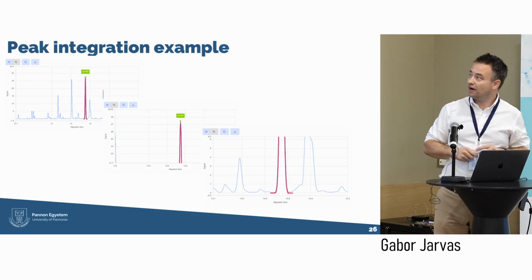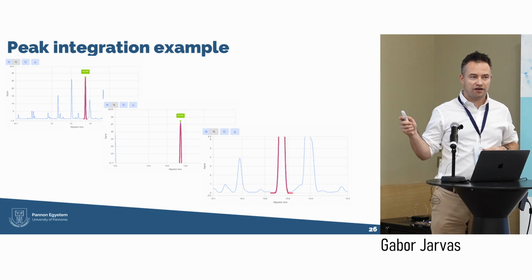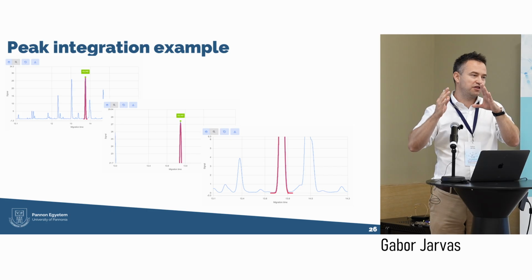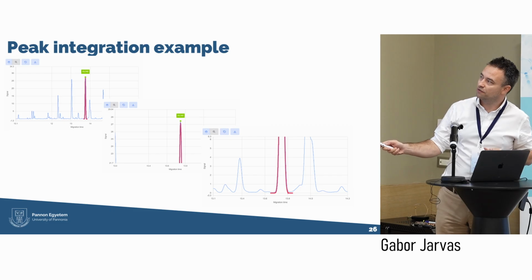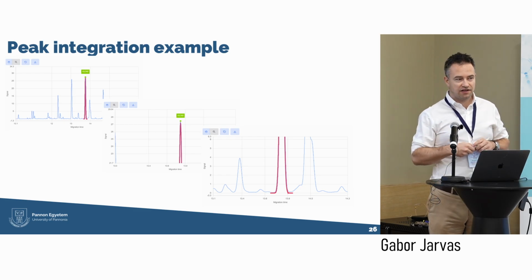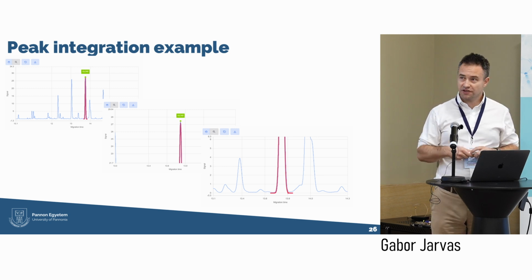And finally, I just show you some examples of how precise it is. Of course, the integration is not done by numerical integration, but we fit a modified Gaussian, which describes the shape of the peaks pretty well. And that's the whole peak. You can see the top of the peak and the baseline. And you can see there are very tiny differences between the fitted and the actual trace, meaning that this integration approach is very, very accurate. So this is where we are right now.